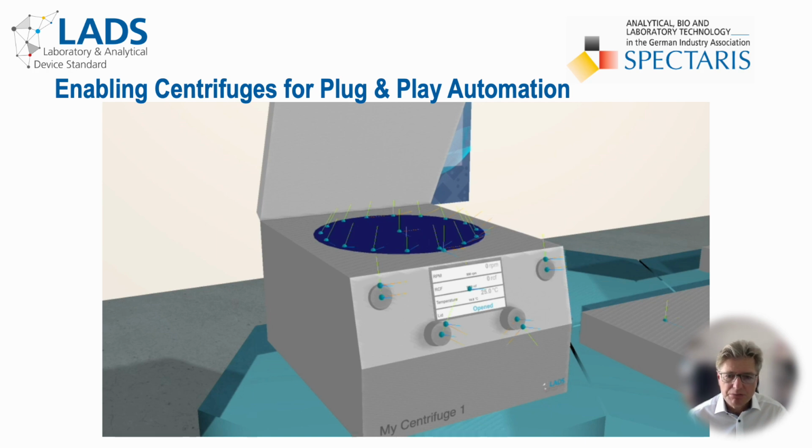The green attachment points define the positions where labware should be placed. Please note that the positions are inclined with respect to the rotor's vertical axis. This is very important information whenever a robot wants to place or pick a labware like a conical vial in the rotor. Whenever stopped, the rotor itself can be oriented in any angle to the centrifuge's cabinet.